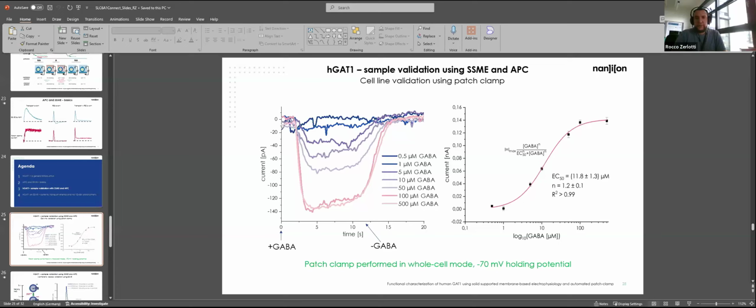So you mean if I am able to assess how many transporters do we have? Right. No, as of now, it's not possible. The problem is that, having this capacitive-coupled system, all these currents decay, but when they decay, they also decay as a function of the sensor itself. So it's a kind of mixed kinetics, and therefore, with the technique itself, it's not really possible to say how many transporters we have.